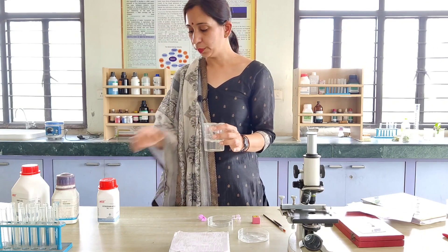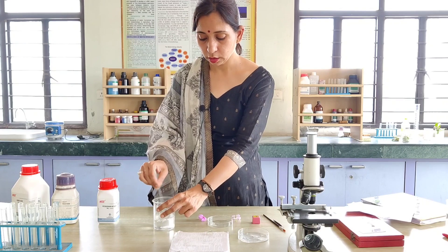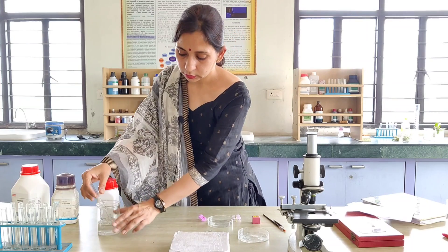Here we have mixed these ingredients in 100 ml of distilled water and in this way we have prepared our nutrient media. Our nutrient media is ready — let's keep it aside.